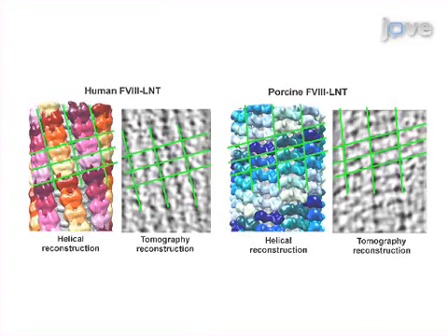tomography reconstructions. The demonstrated method can help answer key questions in the field of structural biology and blood coagulation, such as what is the membrane-bound organization of factor VIII and how it relates to its function in coagulation.